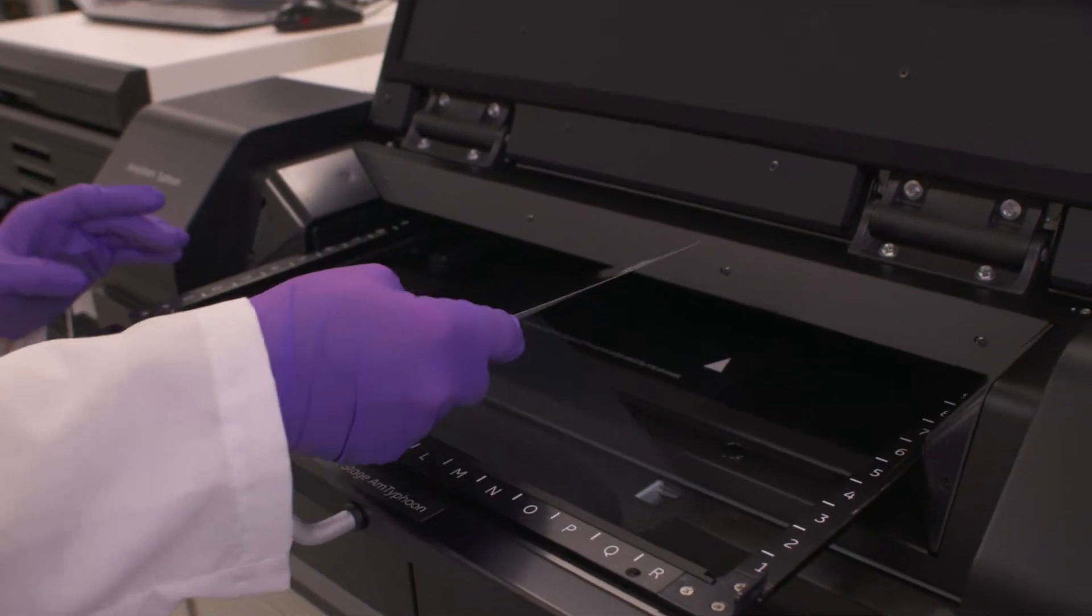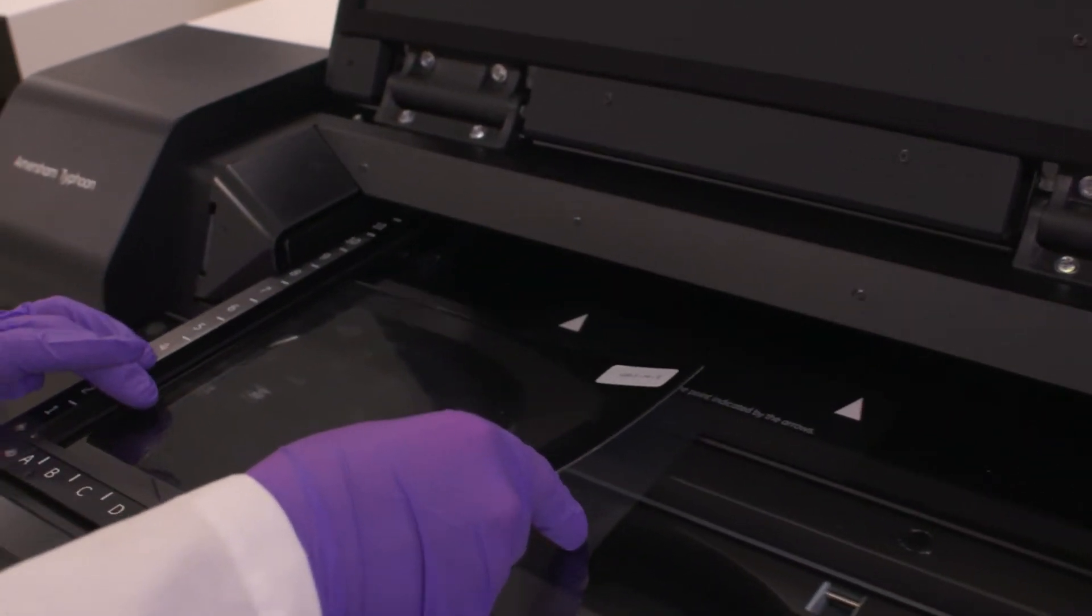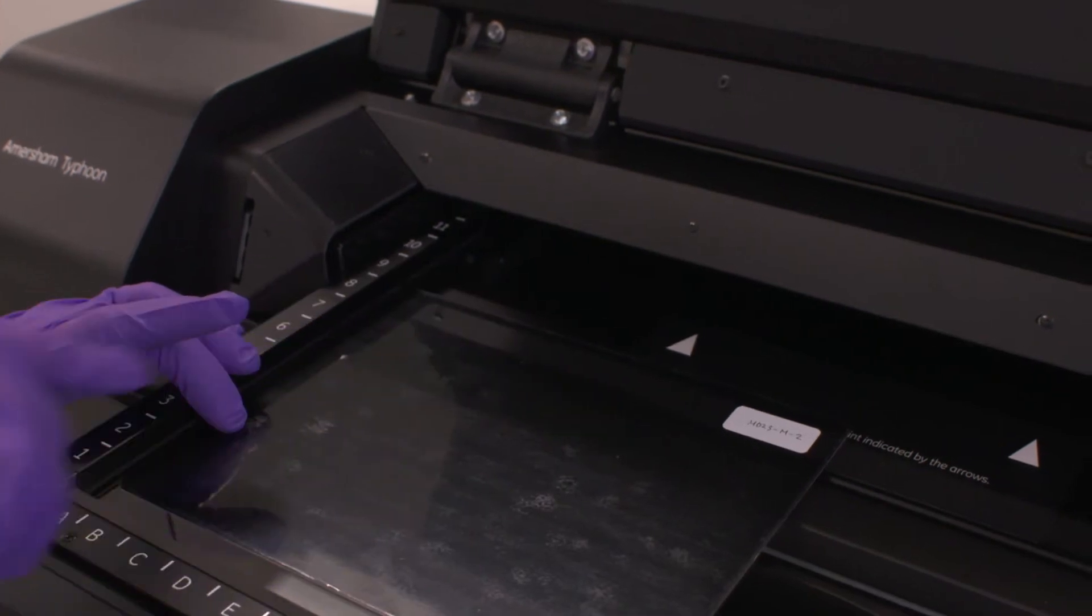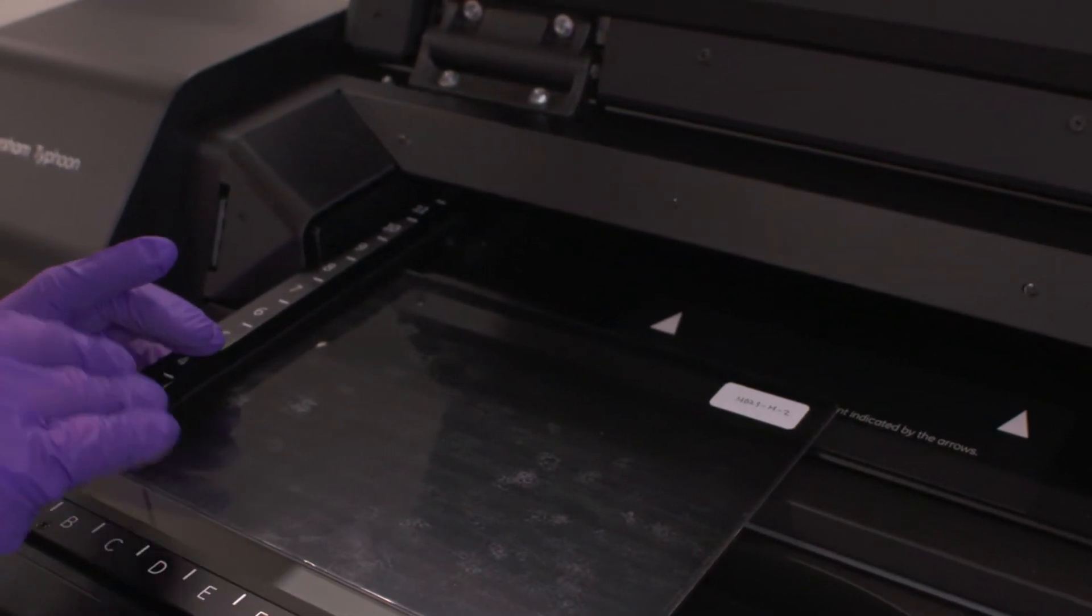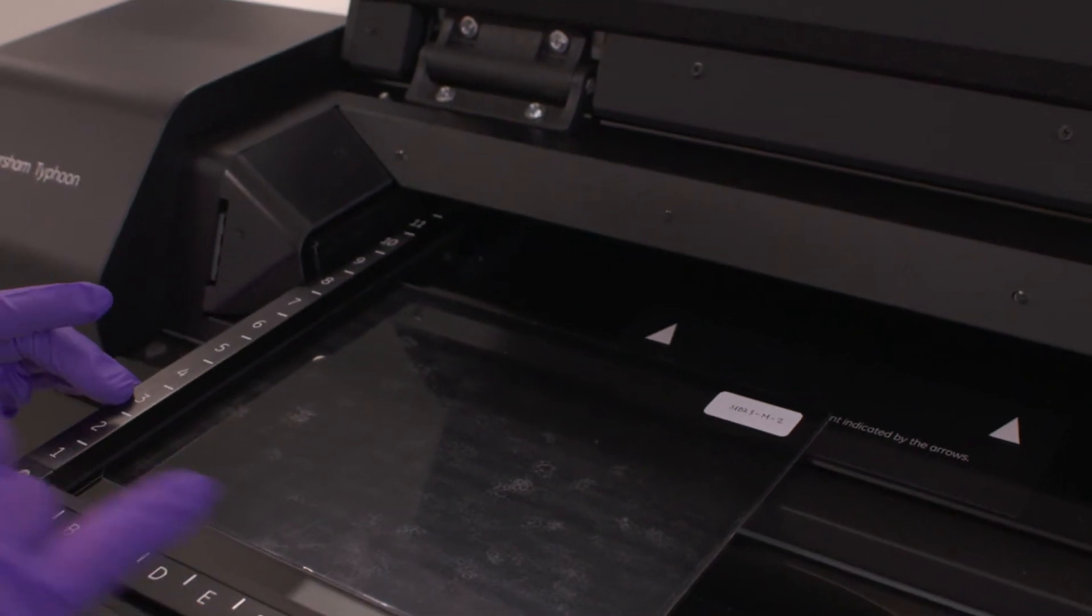When you place our screen into the instrument, it's now going to be very important that we remember the dimensions that we're going to use to set up in the control software. So in this case, I'm going to go from 2 to 9, and I'm going to go from A to J.